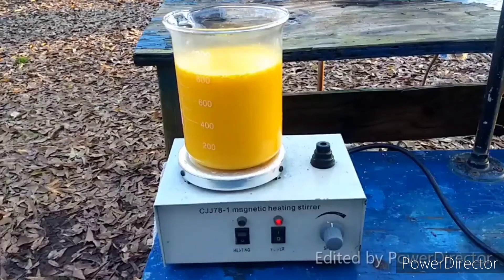There you go — arsenic trisulfide. What I'll do is filter this off and dry it. Then I will use it to make sodium thioarsenate, just because to my knowledge, nobody has done that on YouTube or Bitchute before. So, cool.